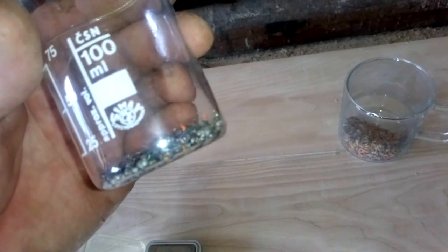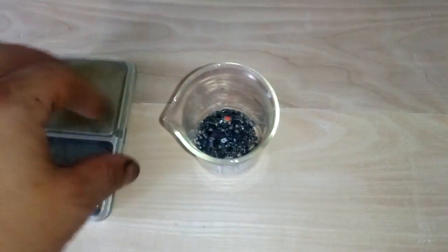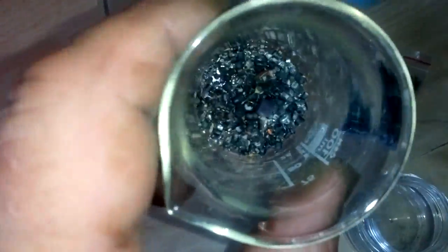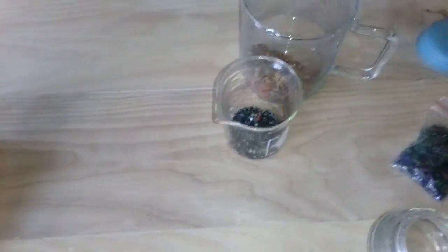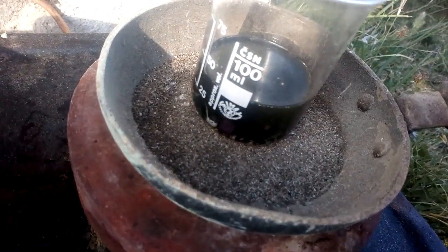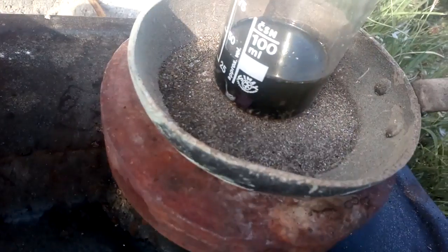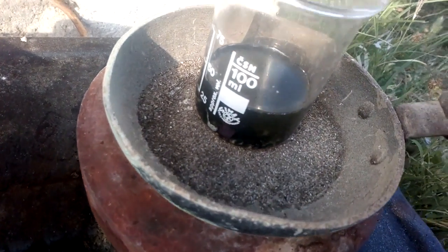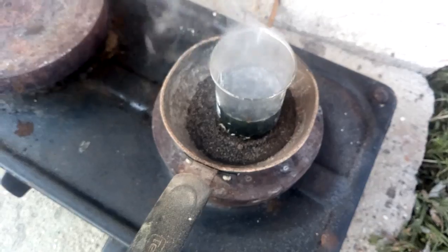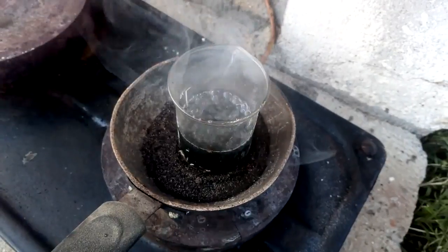Now we add some nitric acid and put it on low heat, because cold nitric acid cannot wash your tantalum properly. We add a small amount of clean nitric acid and it immediately changes color, which means it's starting to dissolve some base metal from the little wires that remain.